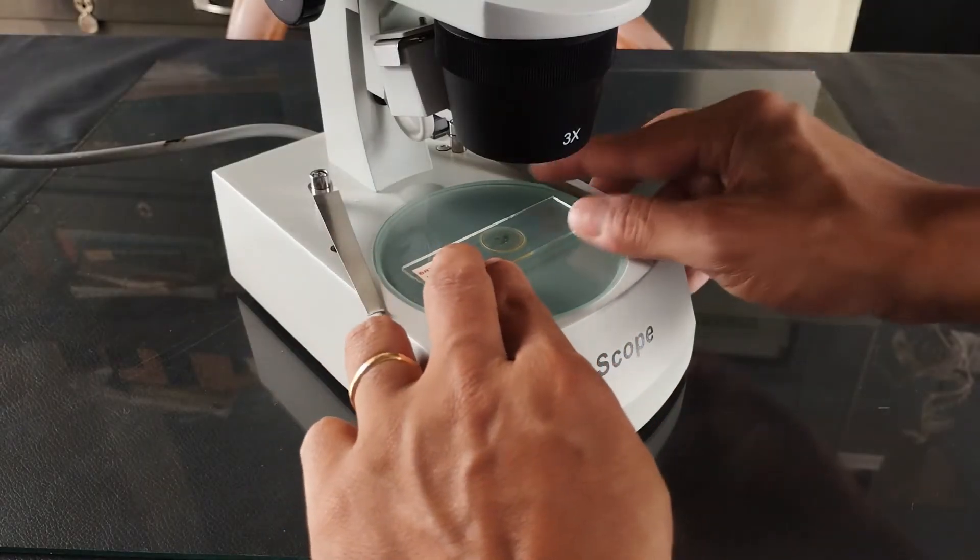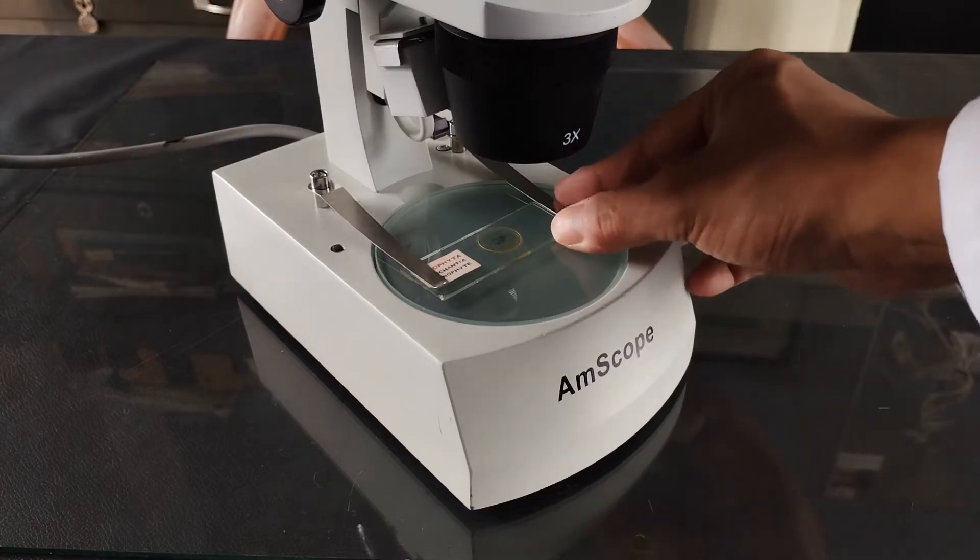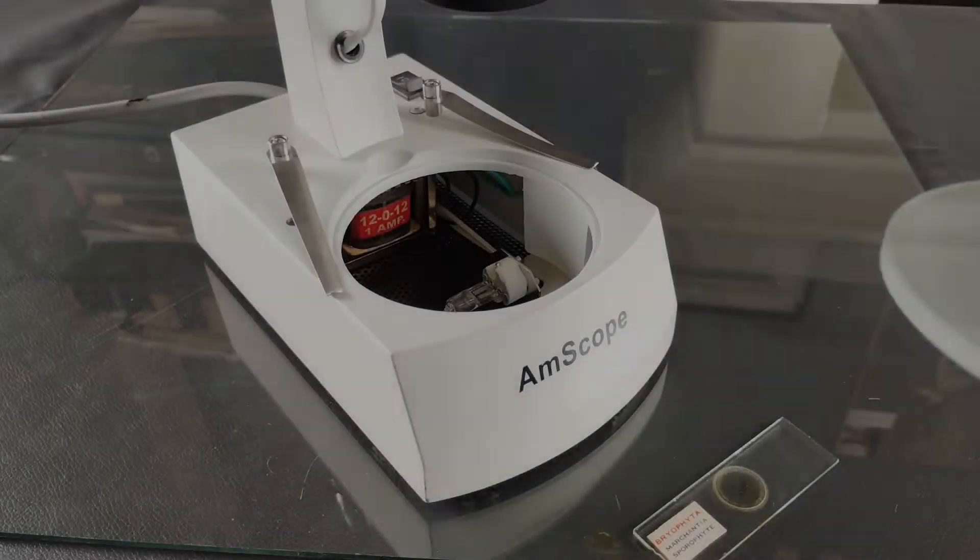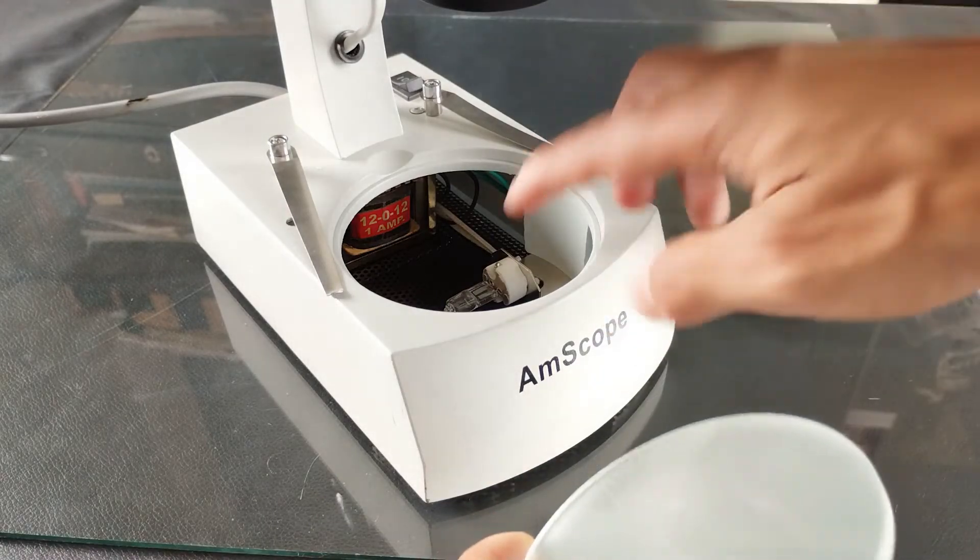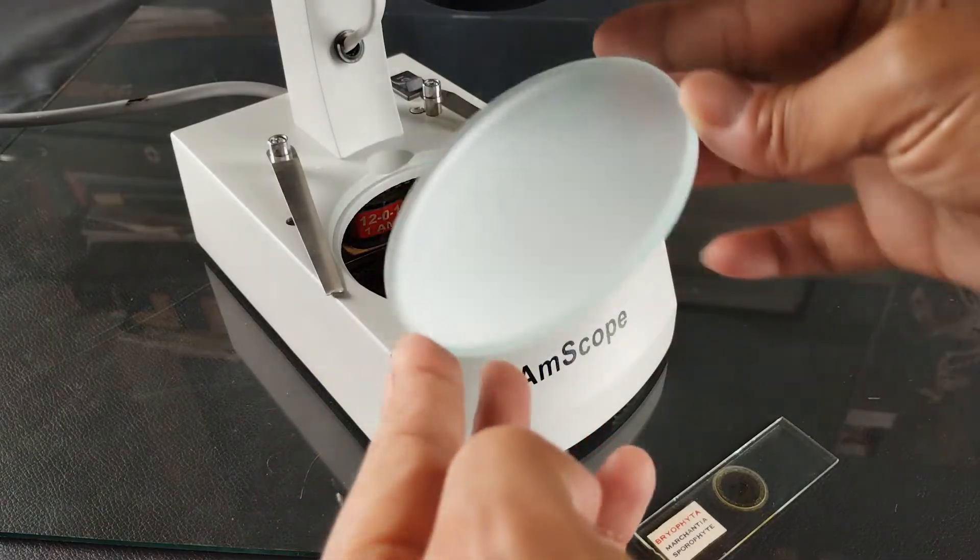Now, place the specimen on the stage and if required, secure the specimen with the stage clips provided. If the specimen is of a transparent type that requires transmitted light to view through it, then turn on only the light source located below the stage. Also use the frosted glass provided for the stage platform.